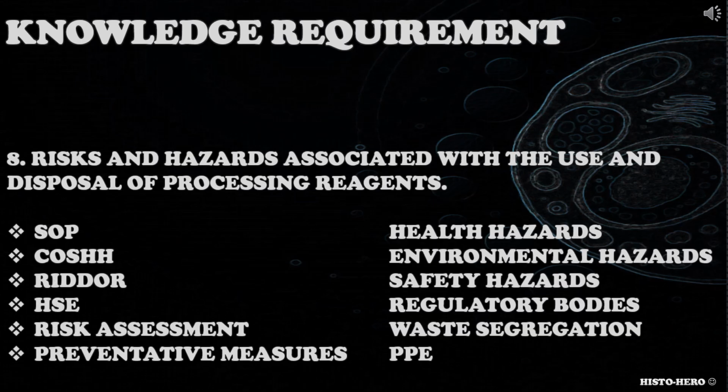The eighth knowledge requirement is risks and hazards associated with the use and disposal of processing reagents. Candidate needs to have the knowledge and understanding about the risks and hazards associated with processing reagents. You could ask the candidate to name the risks and hazards associated with the use and disposal of processing reagents used in the lab, to explain how they would mitigate those risks and hazards, and what preventive measures they apply when using and disposing processing reagents.